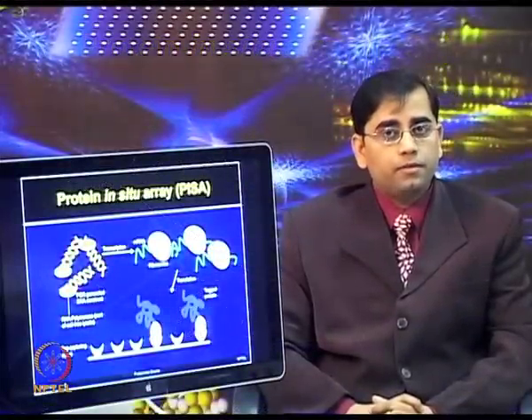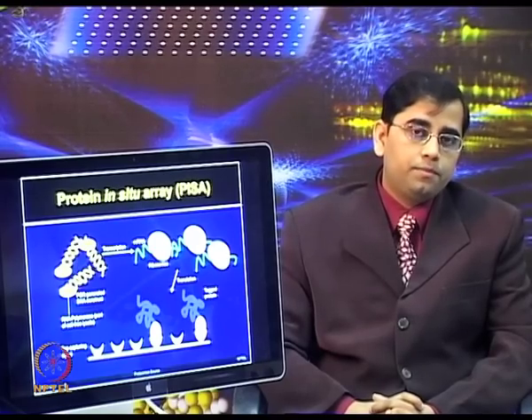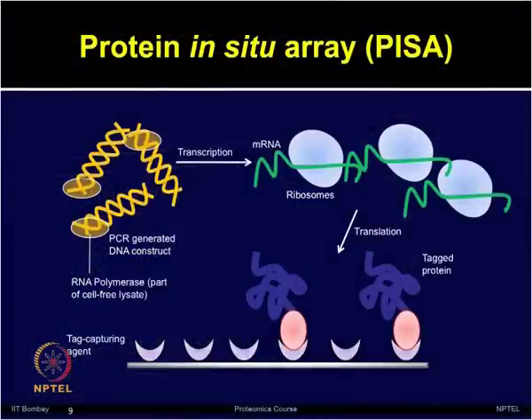The DNA construct contains a T7 promoter, sequence for translation initiation, N-terminal sequence and the termination sequence. Once the protein expression is carried out by using a cell free expression system such as E. coli S30 or rabbit reticulocyte lysate, the protein binds specifically on the surface through the tag sequence and unbound material can be washed off.